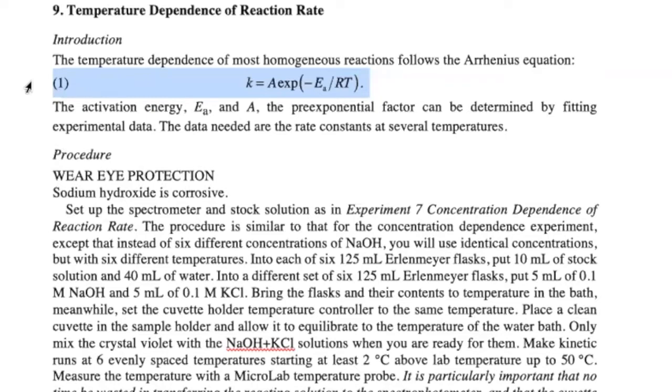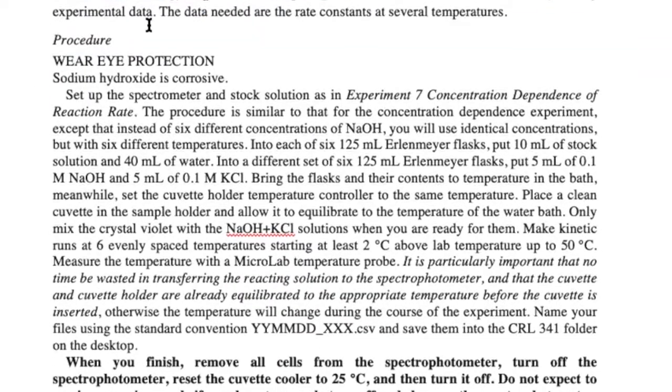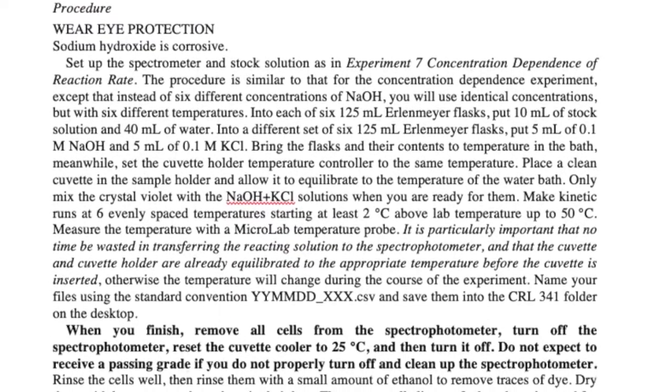Now, a couple of things about that bath that we're going to use to keep the temperature constant. One, when you turn it on, especially if you turn it on after it hasn't been used for a while, you might hear a beeping alarm. The beeping alarm is because it's low on water. If you hear that beeping alarm, you just have to fill it back up. You would get me and I put some water in the back. That'll get rid of the alarm. Two, the heating element is really good. There isn't much cooling power though.